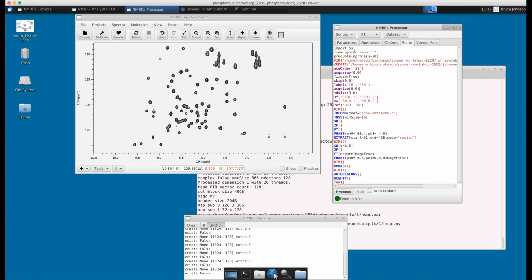importing some Python tools that I use. I look at how many processors your computer has and basically auto parallelize. So these guys have a lot of CPUs, cores in them. So it decided that it could use 20. And so it's going to parallelize this processing.